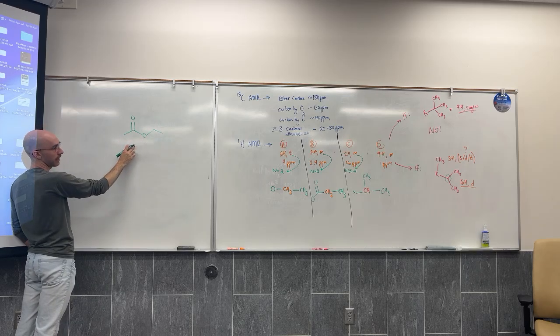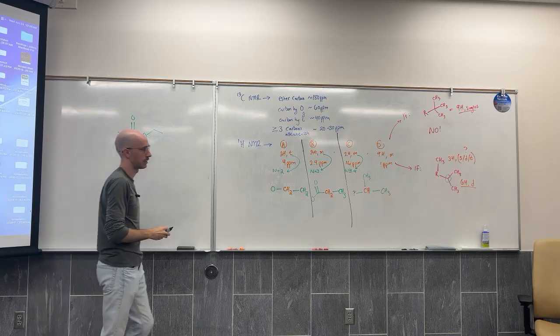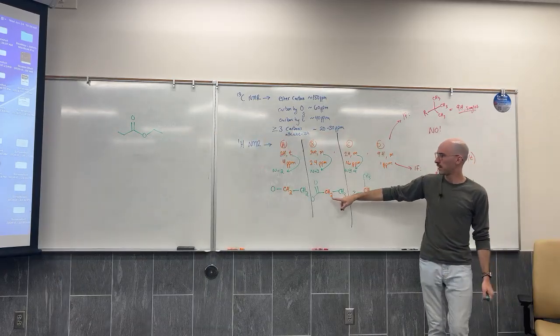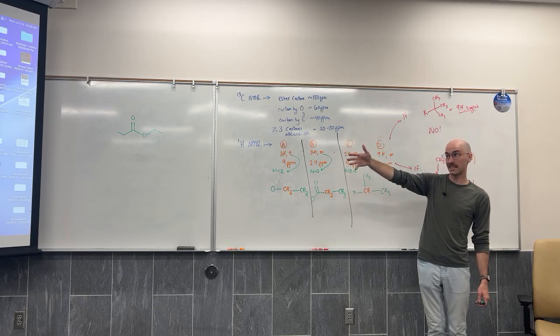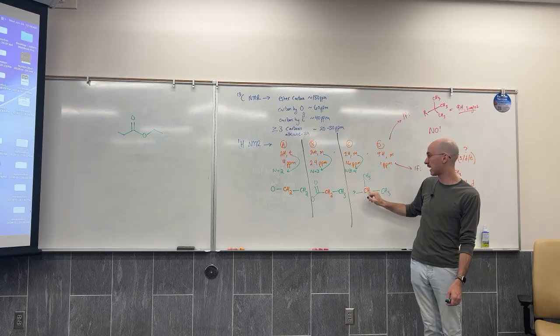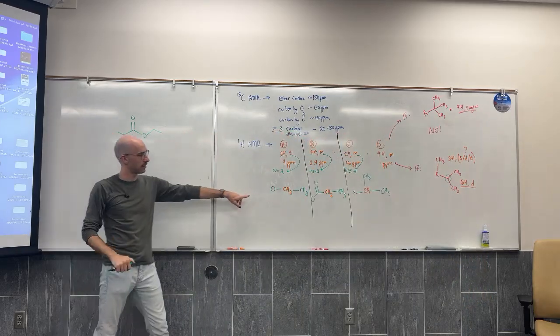And then on the other side, a CH2 next to a CH3. The CH2 of the carbonyl, we felt pretty confident maybe had a CH3 bonded to it because it's got a lot of peaks, so it's got to have a lot of neighbors. Can't be the CH, which means the CH has to be over here next to this guy.